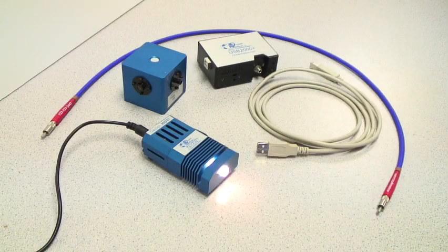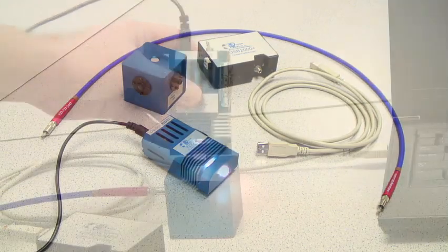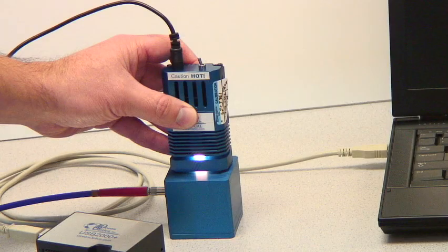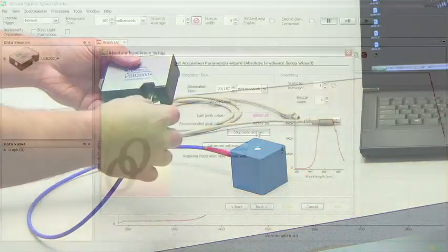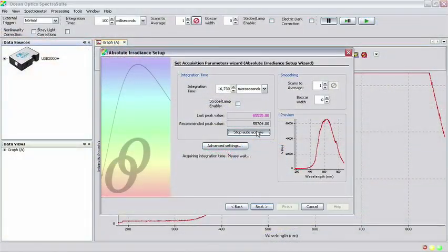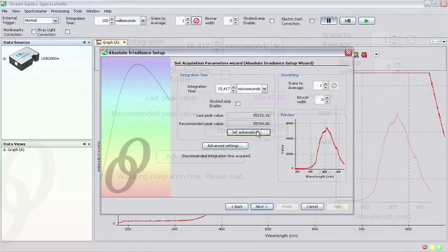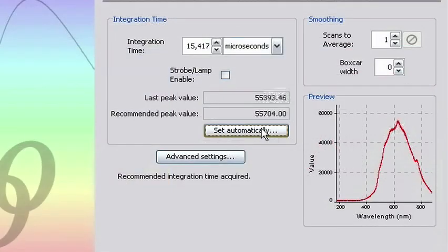In this tutorial, we will illustrate how to radiometrically calibrate an Ocean Optics spectrometer in SpectraSuite for applications that will utilize an integrating sphere.